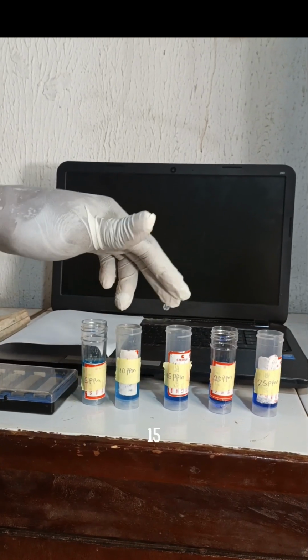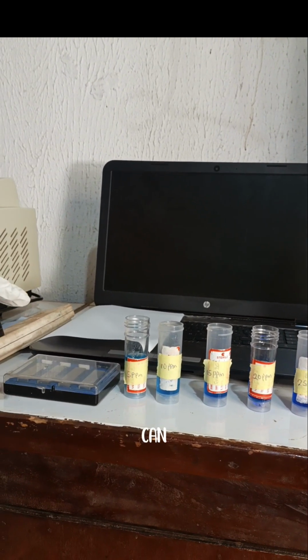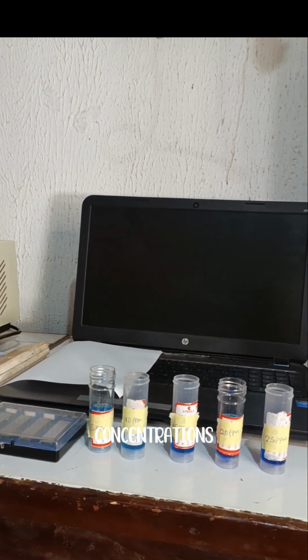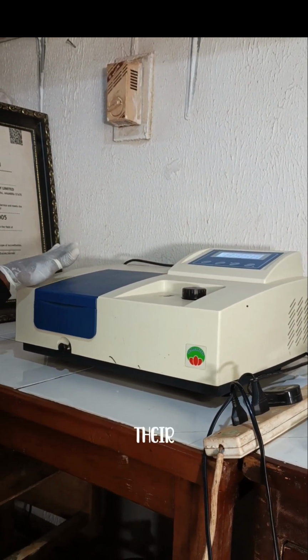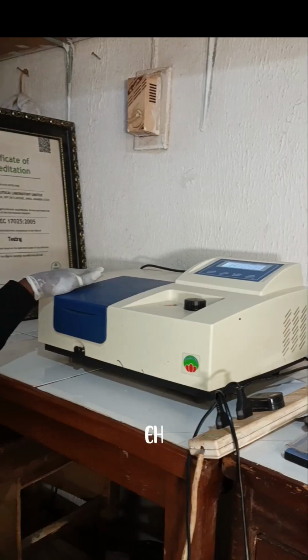So these are different concentrations: 5 parts per million, 10, 15, 20, 25 parts per million. As you can see, the concentration is increasing gradually. So what we'll do is to feed these concentrations to the UV visible spectrophotometer and obtain their absorbances. Then from that we can make a plot of absorbance versus concentration.